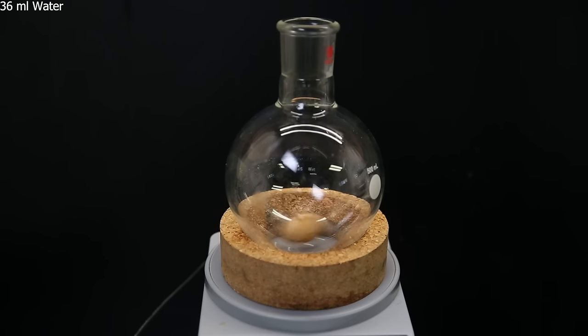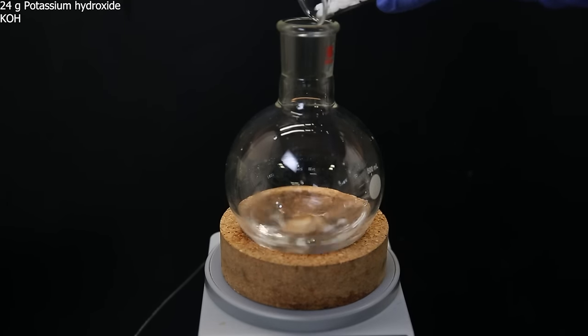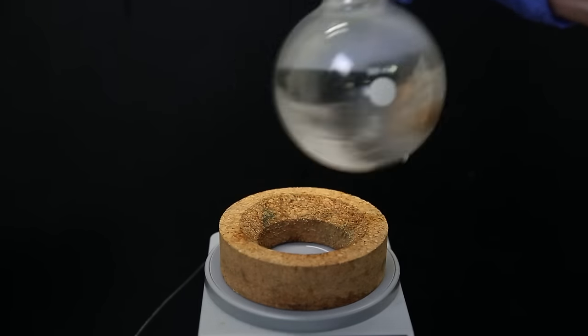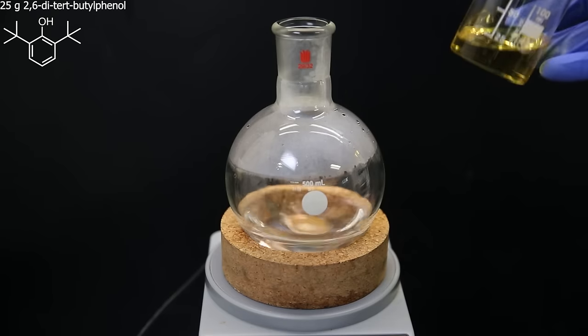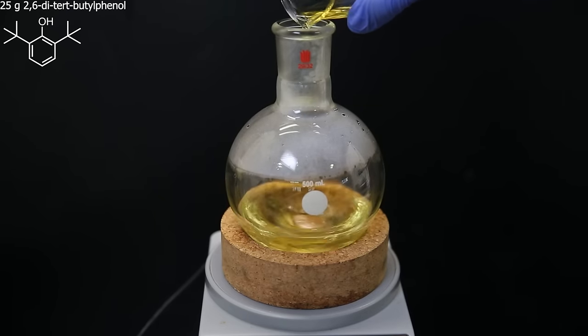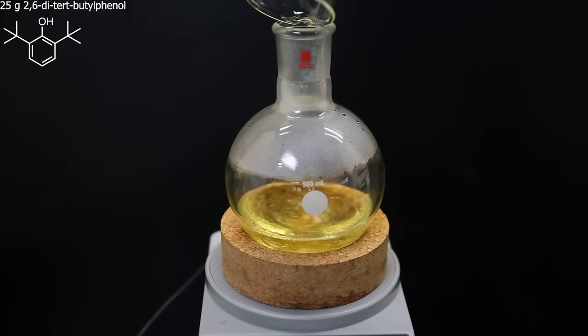So I set up a flask with a stir bar and add in 36 ml of water. I then add in 24 grams of potassium hydroxide and shake it around, because this cheap stir plate is crap. I then add in 25 grams of 2,6-di-tert-butylphenol, which has a melting point close to room temperature, and I had to liquefy it with a heat gun, since it was one big solid in the bottle.